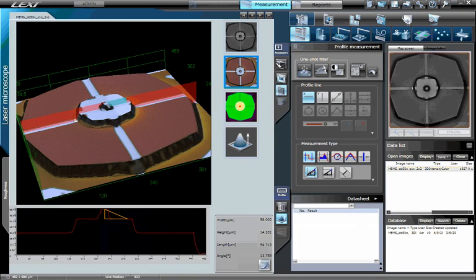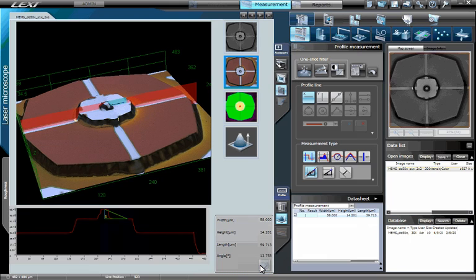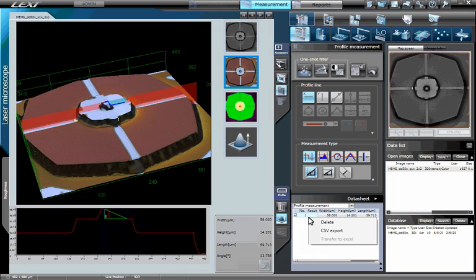All measurement data is displayed in the bottom right and is dynamically adjusted while you move the line profile and measurement positions. To record the measurement data, click the button Export to Data Sheet. Now the measurement results have been saved and can be exported via CSV format, Microsoft Excel, or used to automatically create a report.